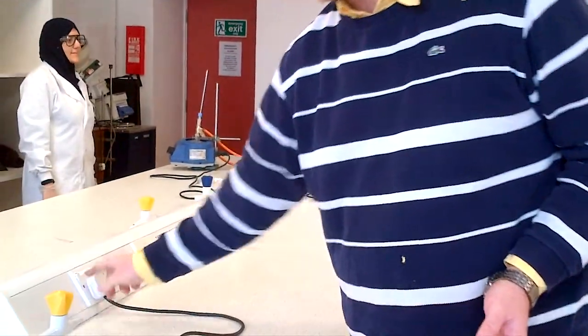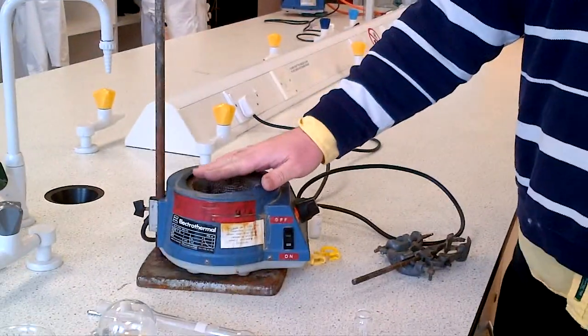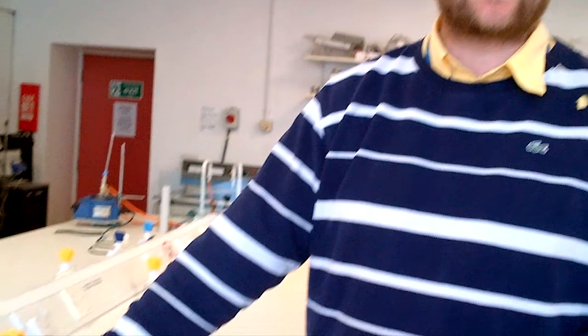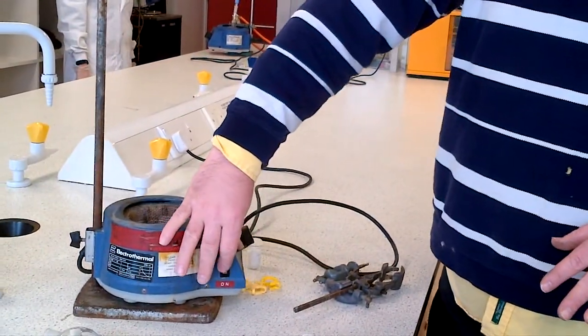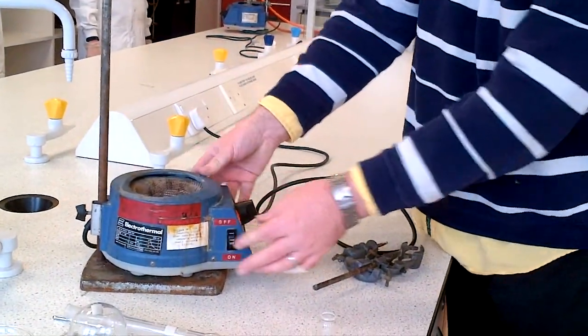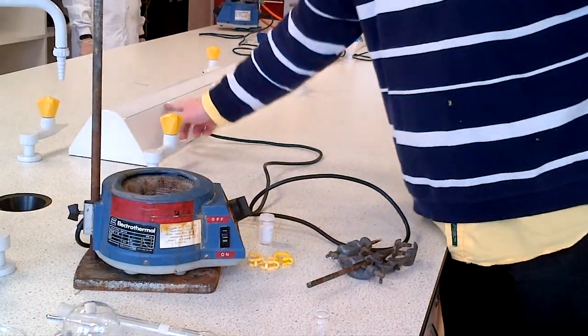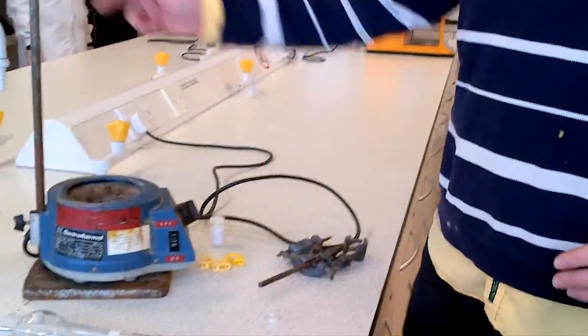But before you do anything, it's worthwhile to make sure the heating mantle is actually heated. You don't want to set everything up and waste valuable time by realizing the mantle isn't heated. Switch it on, put your hand over the trough to check it starts to heat. While you're assembling the kit, turn everything off so you don't burn yourself.